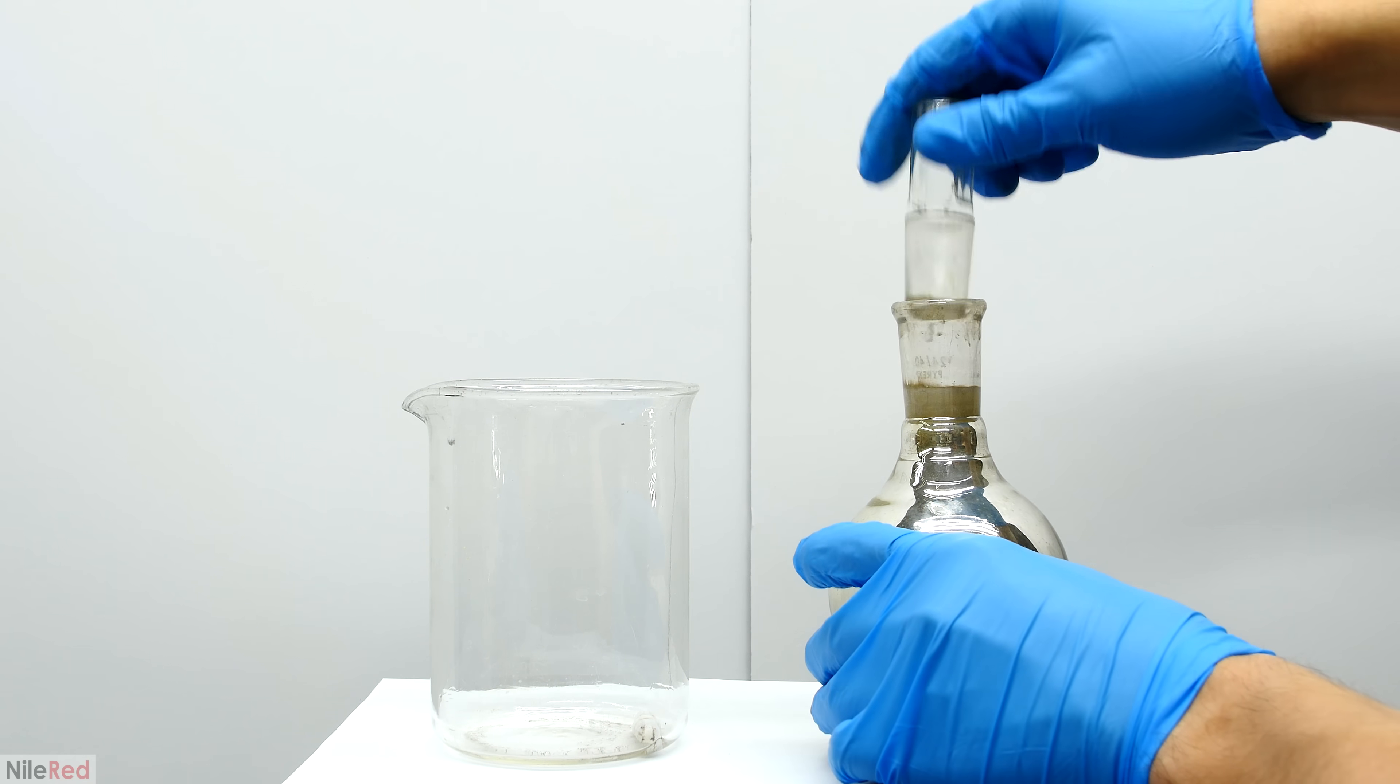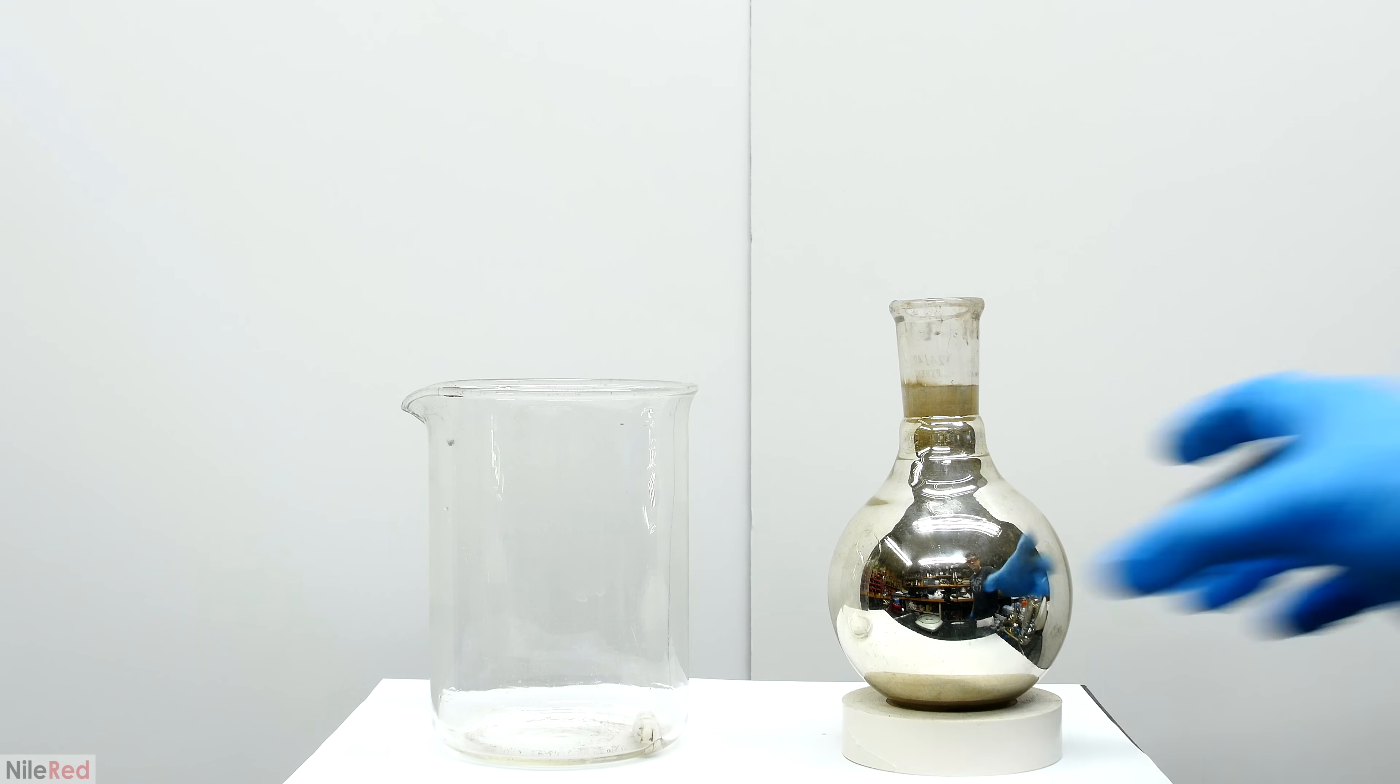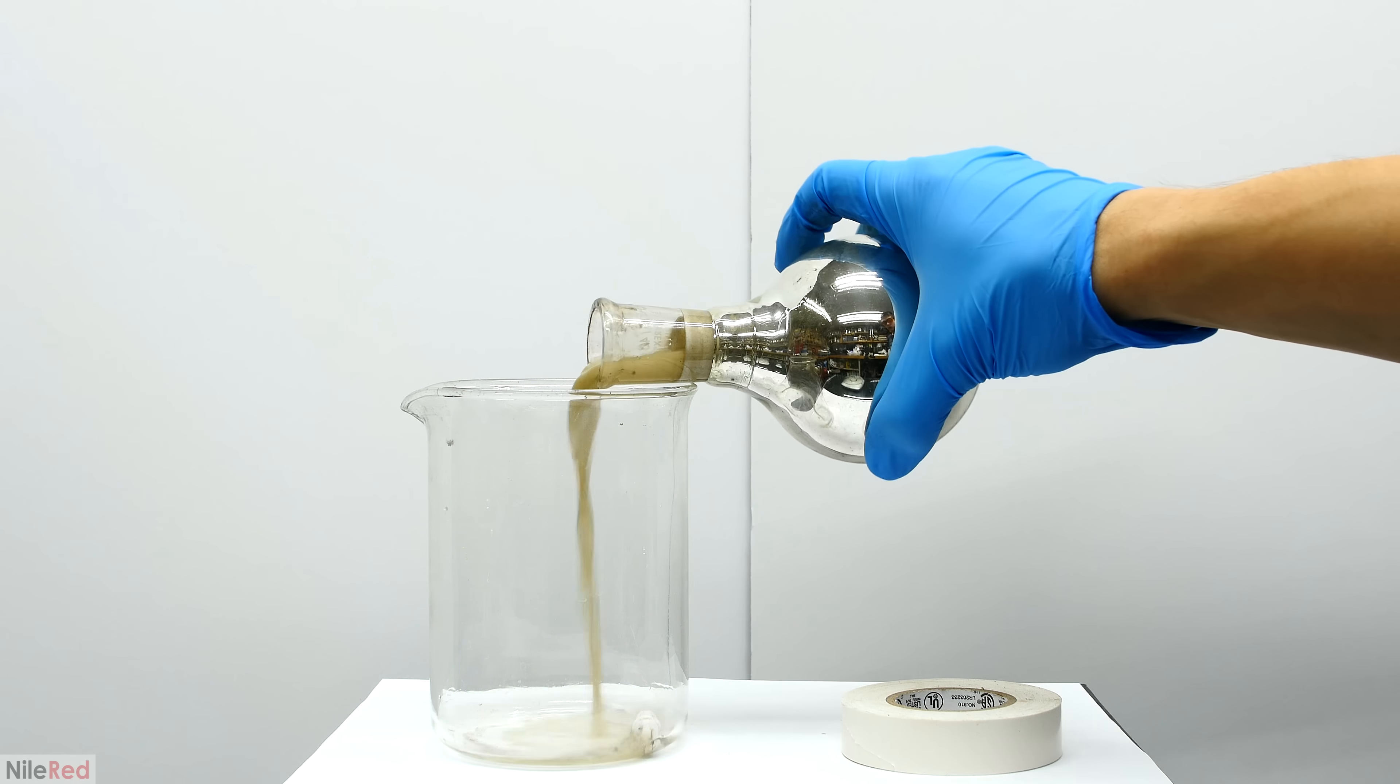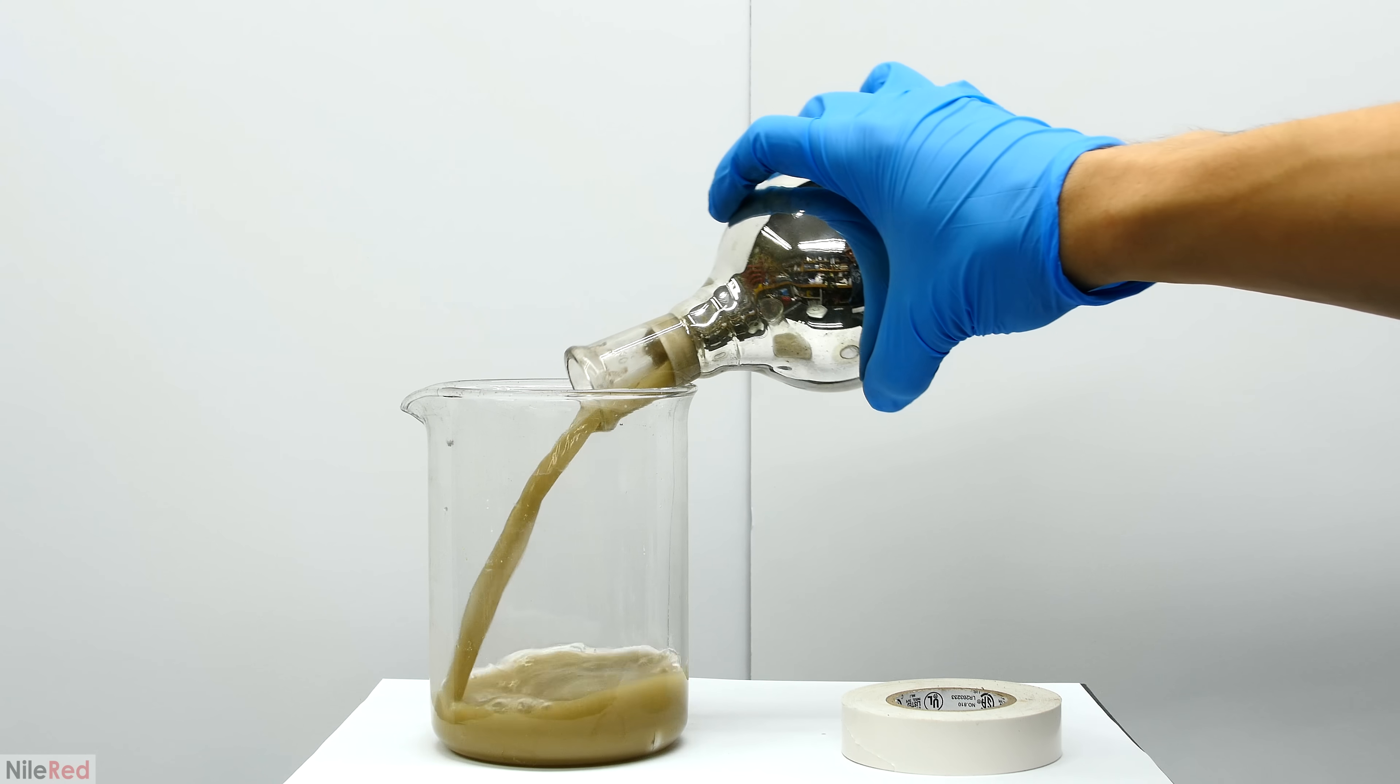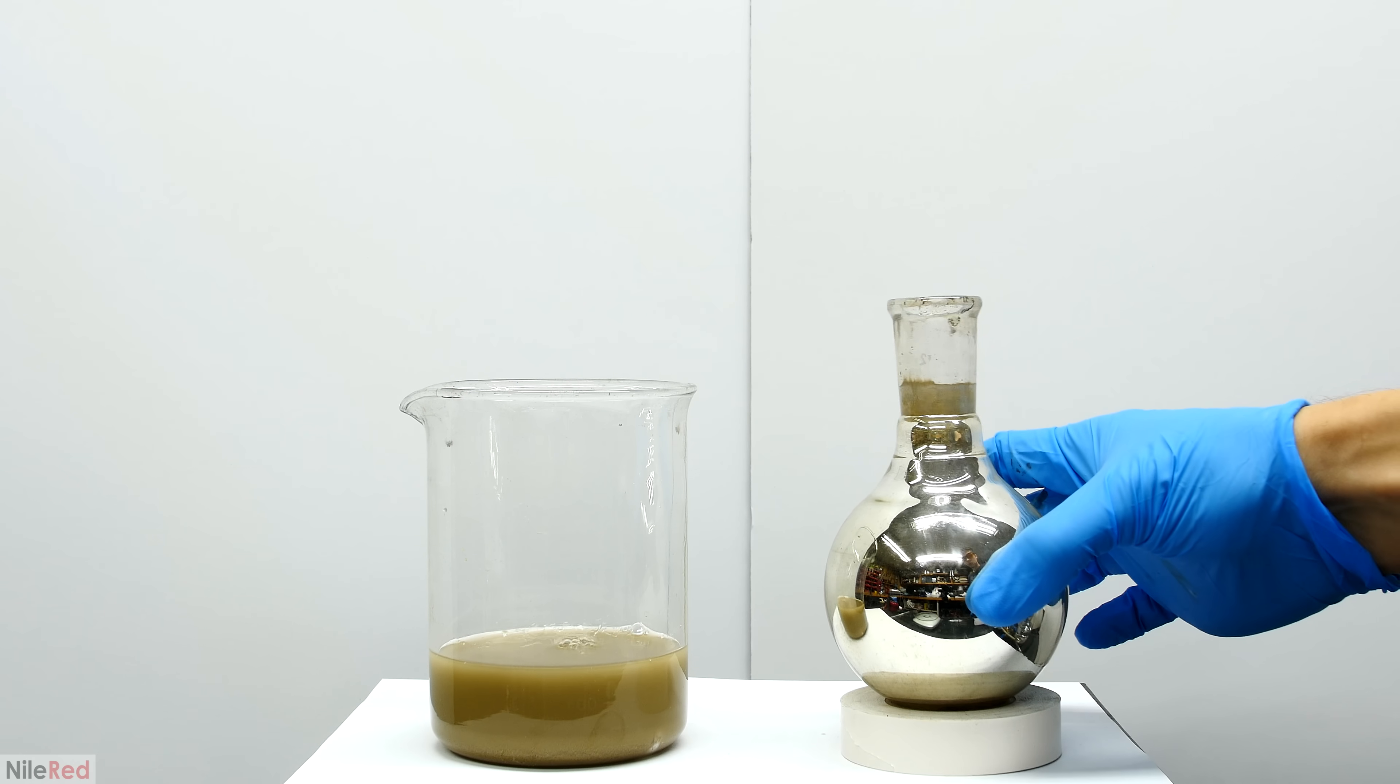Once I was satisfied with the mirror, I could dump out the contents of the flask. The waste here contains a little bit of silver which can be recycled. It would only be something like a dollar or two worth of silver, so I don't really think it's worth the time.